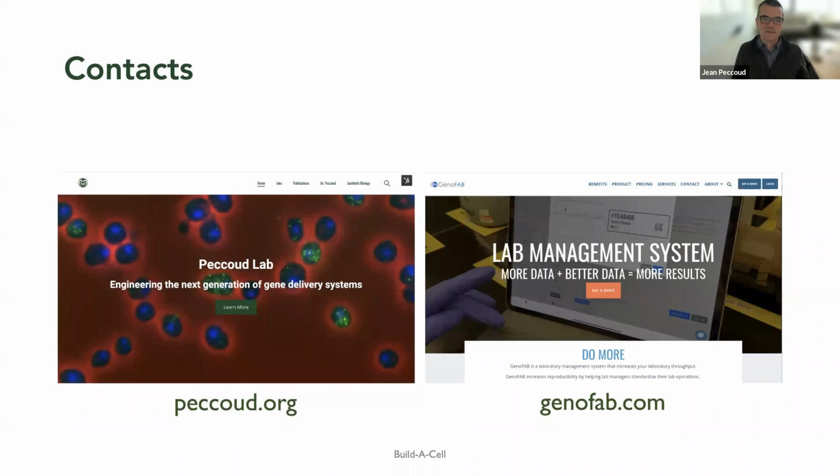So, for instance, in a sequencing experiment, you go from a library to a set of sequencing reads. The next step in the process should be not a bioinformatician developing some kind of custom script to analyze your data, but a sequence assembly pipeline that is robust enough that you can tweak the parameters and go from your reads to your assembly. So all those tools need to be connected to your data management system.